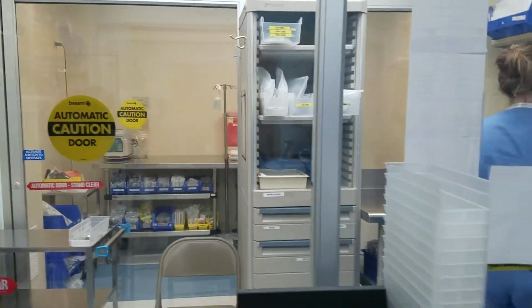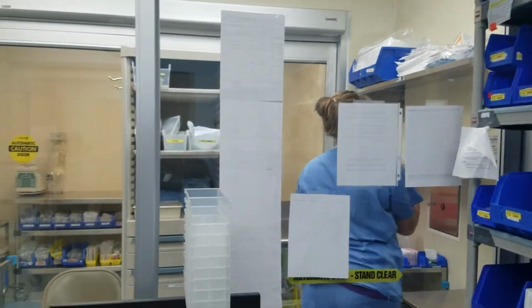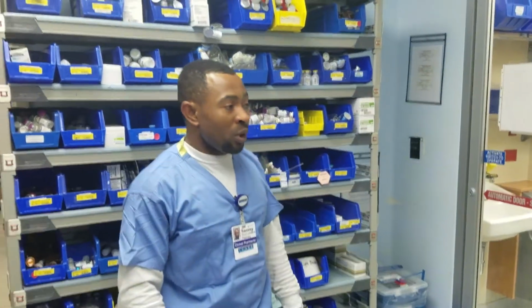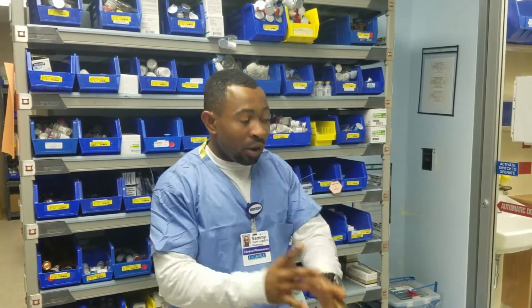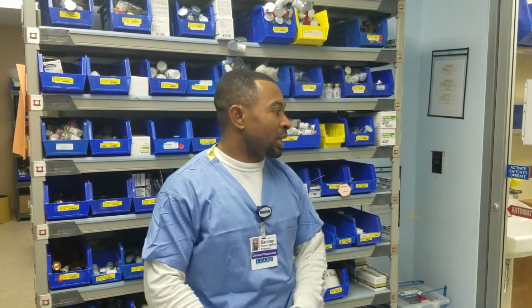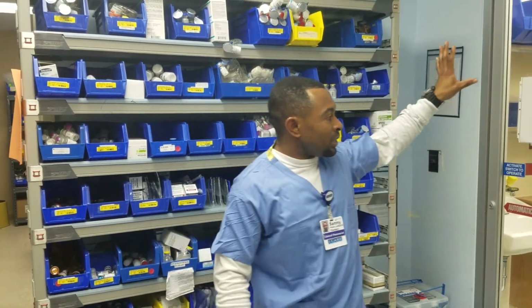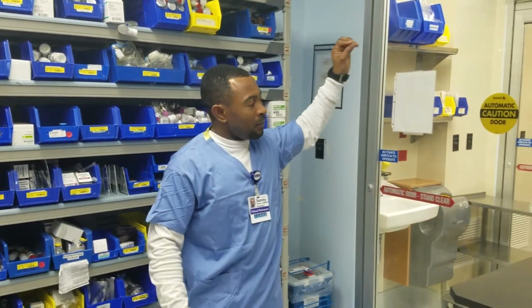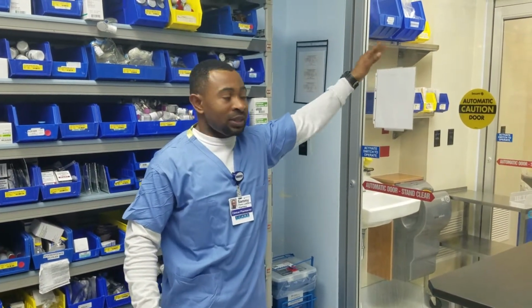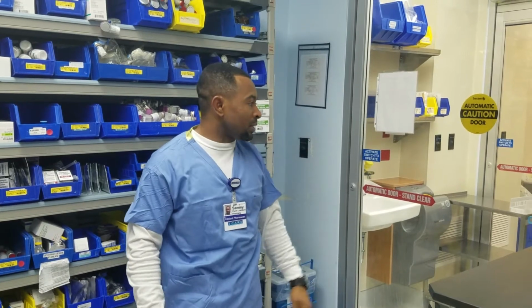and making sure that all the things that we are preparing on that side there are all sterile. And technicians as well as pharmacists included, before we go in there, we all have to be well gowned with our mask on, gown and gloves, and make sure that everything is all wiped down with alcohol and swab. So all the way in the back there, the products that we prepare there, we give them a longer stability because that's our most clean area of the pharmacy.